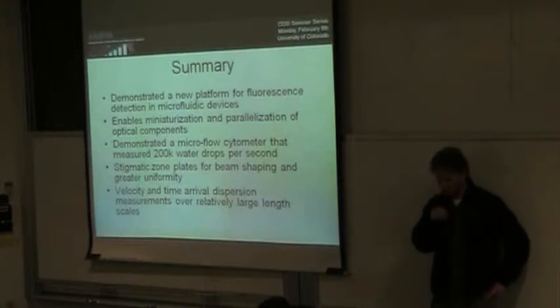Sometimes after we made our master, we can silanize it, which allows the PDMS not to stick very well. You just put it in a vacuum chamber for a couple hours with a little bit of silane. Then you pour the PDMS on it, bake it overnight, peel it up. I mean, it will work the second time you do it, if not the first.